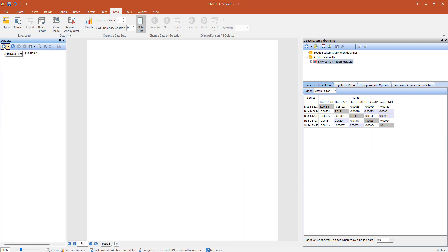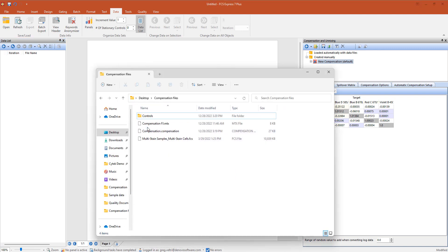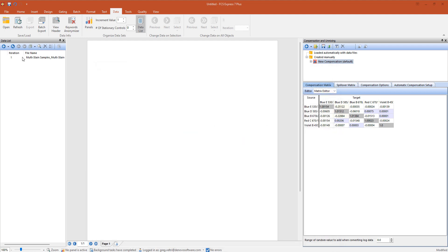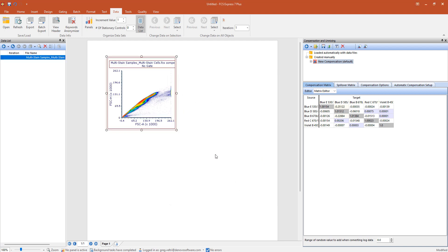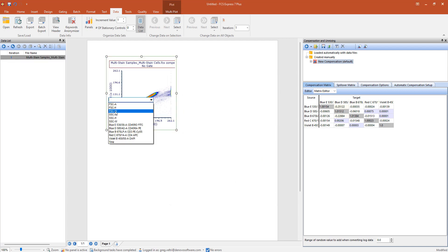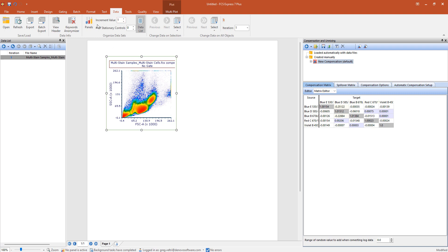We will now load the data into the data list. The file will automatically use your imported compensation and be analyzed as desired. With FCS Express, parameters are not prefixed with Comp, but the title of the plot will include the file name suffix with Compensated to indicate that compensation has been applied.